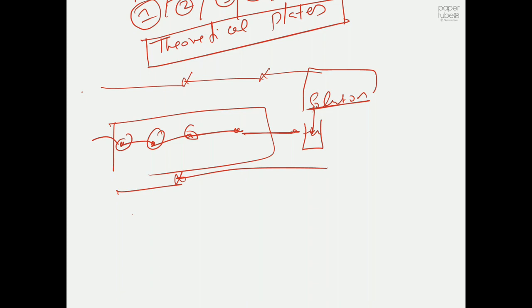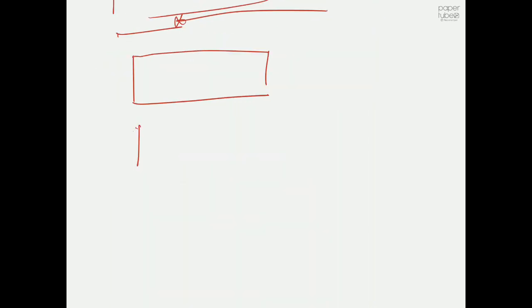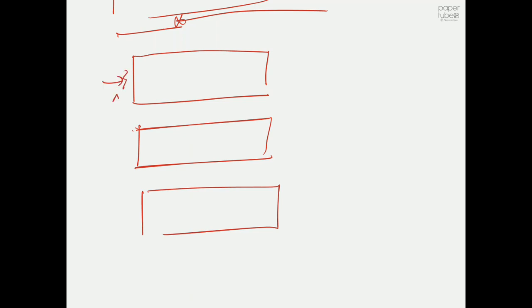If you think this is very difficult to understand, we can even set up a simple experiment. Say we have some horizontal column. We supply only one molecule of A, and then only one molecule of B, and then one molecule of C. And let's assume we have some super smart detector at the exit of the column that can exactly identify the time at which a single molecule reaches the column exit. Obviously it's going to get adsorbed onto different particles in the column, and eventually it reaches the column exit.